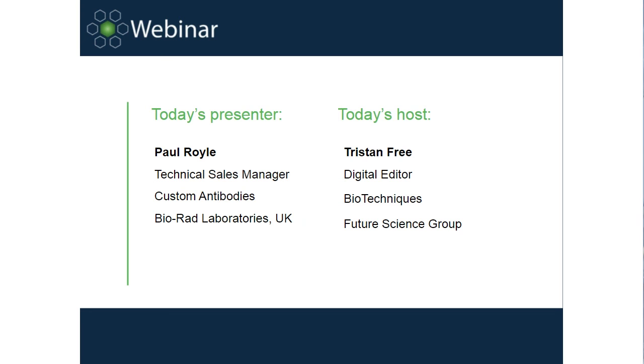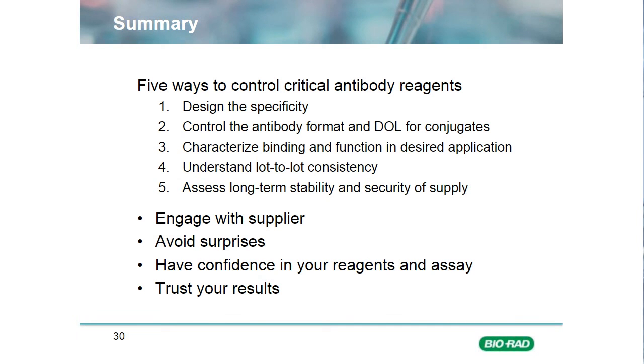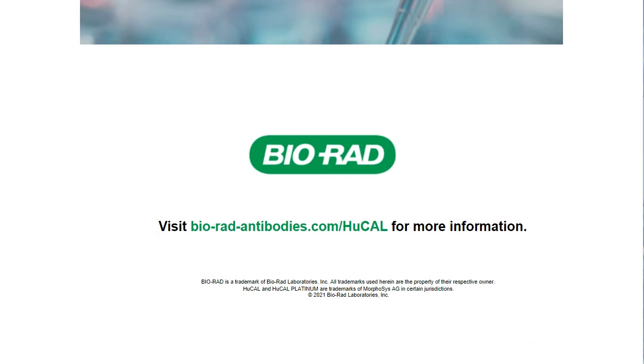So the first question to come in, Paul, is do you make customized antibodies, for example for drug compounds, to be used in PK assays? Thank you, Tristan. So for this question, if I understand it correctly, the question's about tool antibodies. So we make tool antibodies routinely as capture and detection reagents which specifically recognize the drug compound. And we also make them as positive control reagents or neutralizing antibodies depending on the customer requirement.